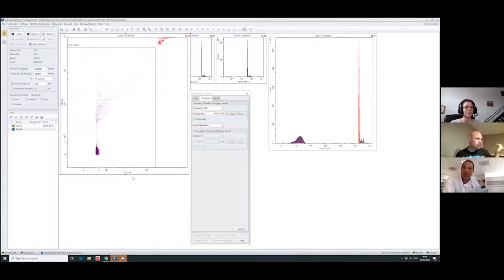Okay, we usually would be perfect not to see anything, but we have the noise, and it's good to show. Up to here is noise, from here up is my sample. We have been talking about the background noise of the sheath, and making sure that we have no interference with the antibodies coming up as well and showing up. So we need to show that there is some noise and where the noise is coming from. Okay, as long as you have it controlled.